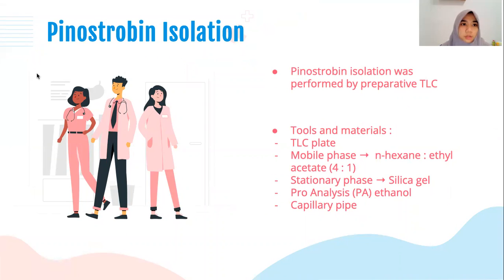And then the isolation of pinostrobin. The isolation was performed by preparative TLC. For the tools and materials, there is a TLC plate. The mobile phase used is N-hexane and ethyl acetate with a ratio of 4 to 1. The stationary phase is silica gel. And then there are pro-analysis ethanol and a capillary pipe.